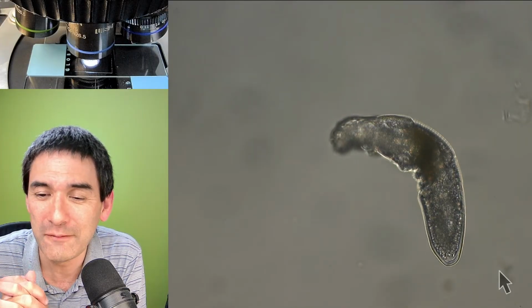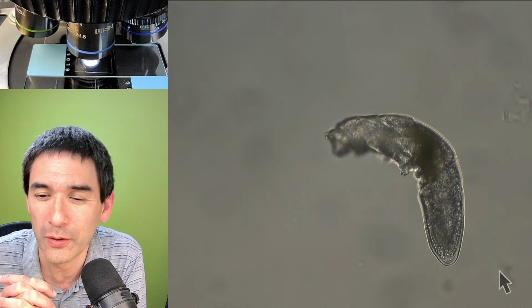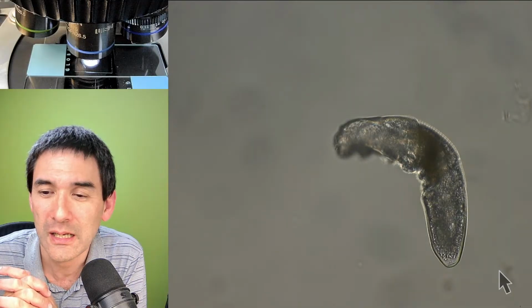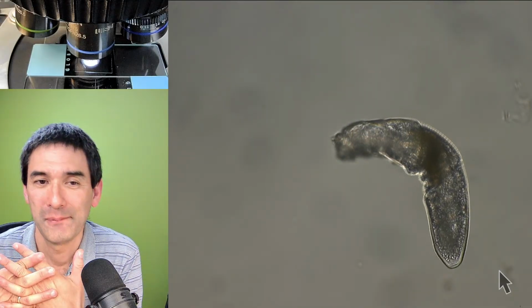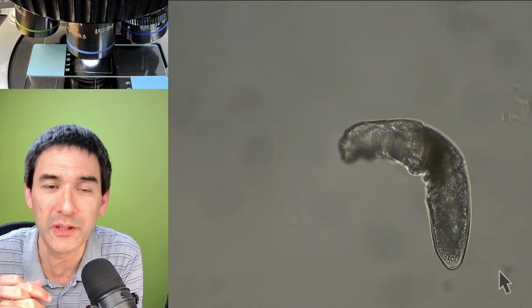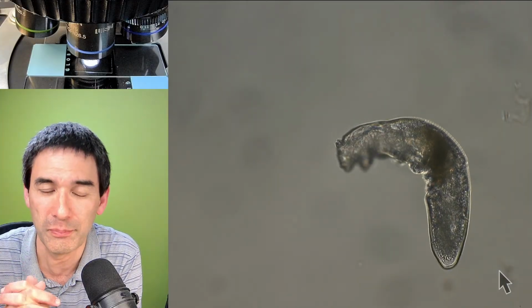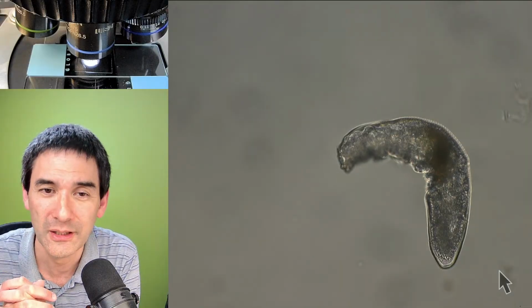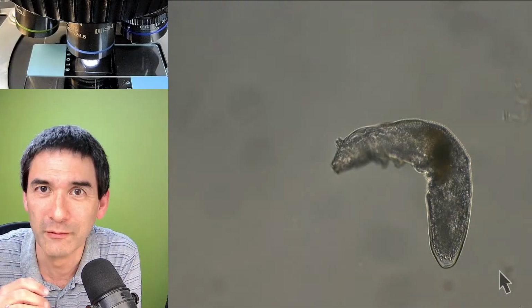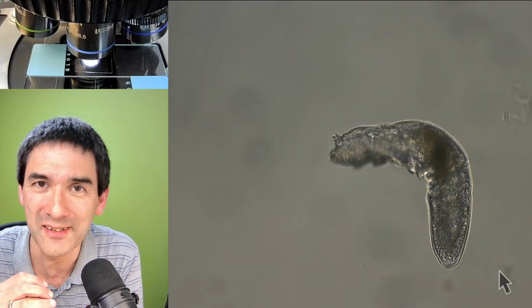So technically, face mites and humans are a type of commensalism, right? It's not really mutualism or parasitism. I would say that we humans don't benefit and don't have a disadvantage from those face mites. So in that sense, it's some evolutionary coexistence that we have.